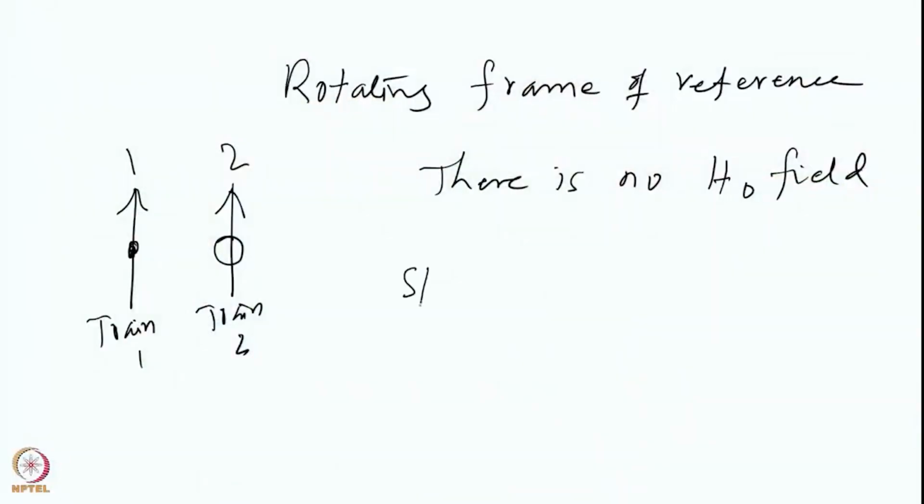Let us talk now about an important concept at this point in time, and that is called spin lattice relaxation.